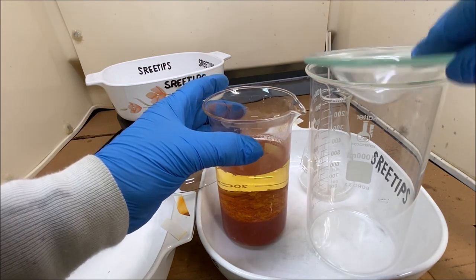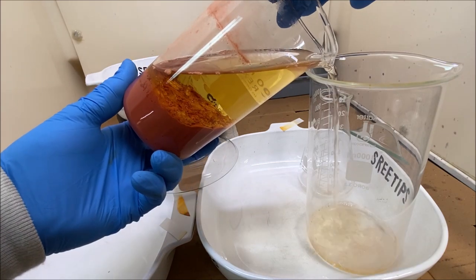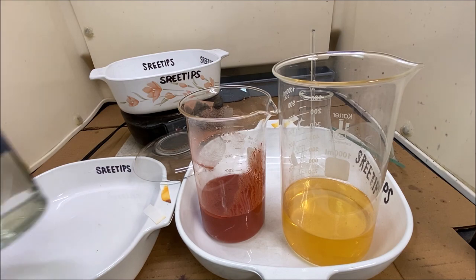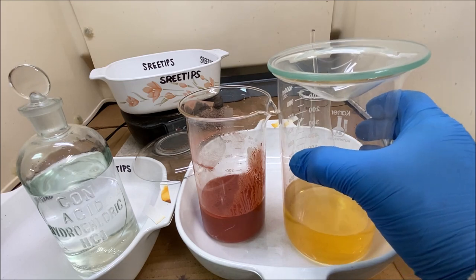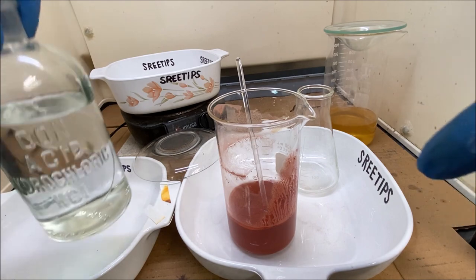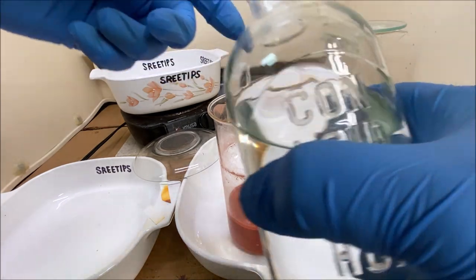We're going to pour this waste solution off into a waste beaker carefully. Ammonium hexachloroplatinate precipitate is usually a bright yellow color, but our precipitate here is a pink color and it's got iridium in it. I didn't see any iridium in the solution we just poured off, so all the iridium stayed in the precipitate. This is hydrochloric acid - we'll try rinsing with hydrochloric acid and see what happens.